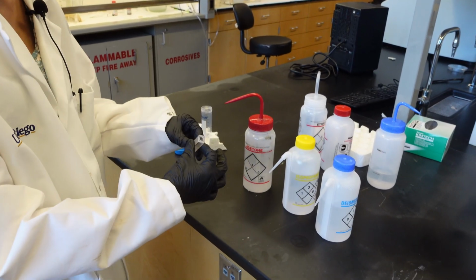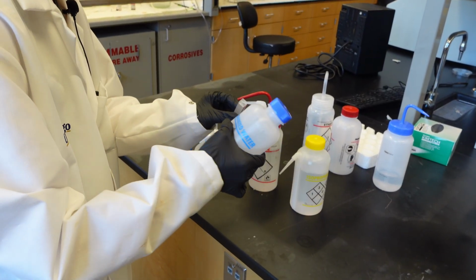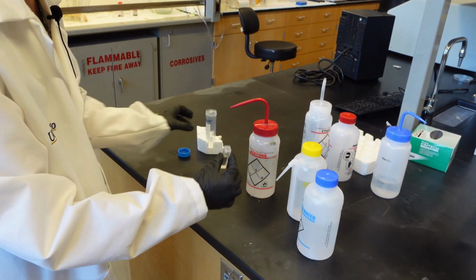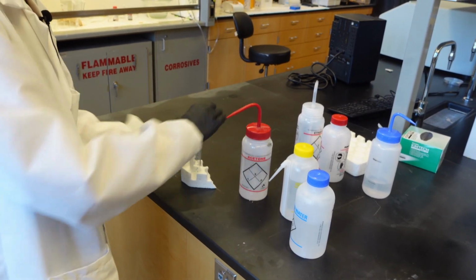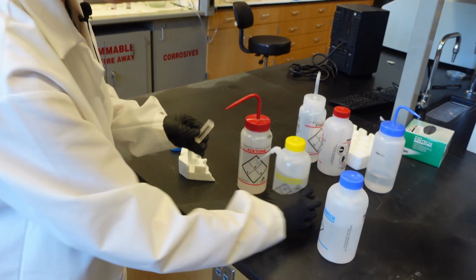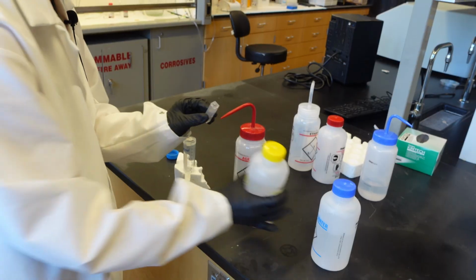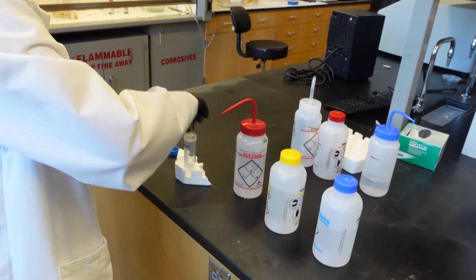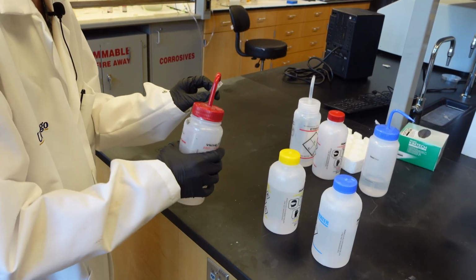First we're going to rinse it with water. Make sure you have a waste container as well, so you can dump that out. And then after the water, you'll do an IPA rinse. And then after the IPA rinse, you'll do an acetone rinse.